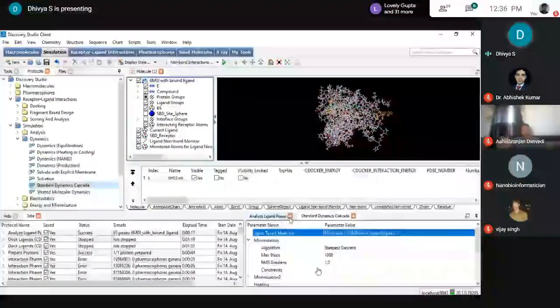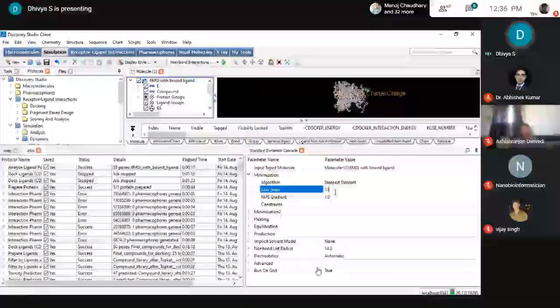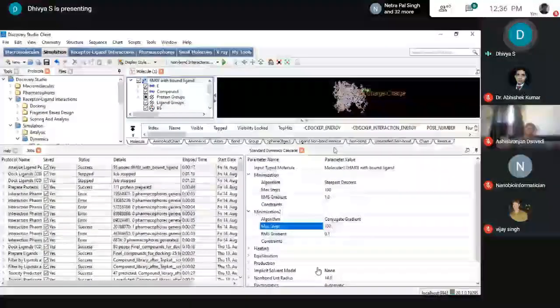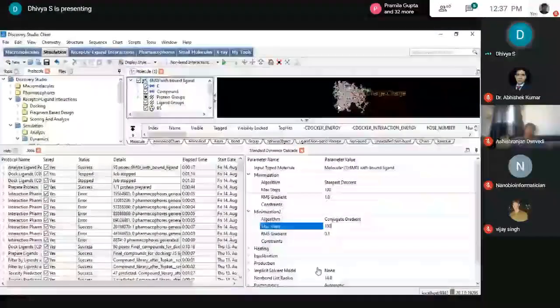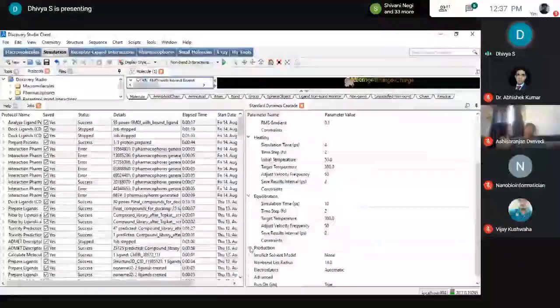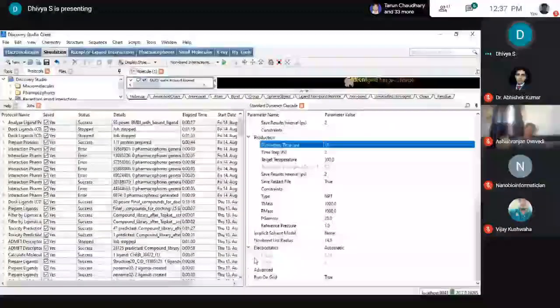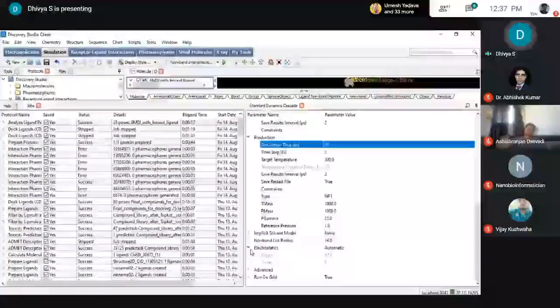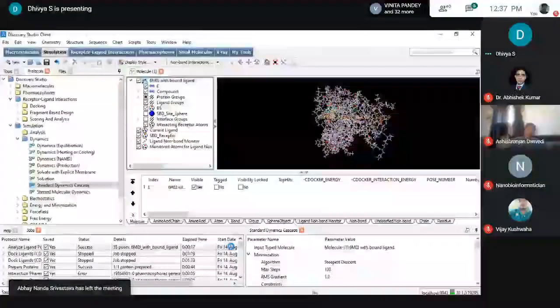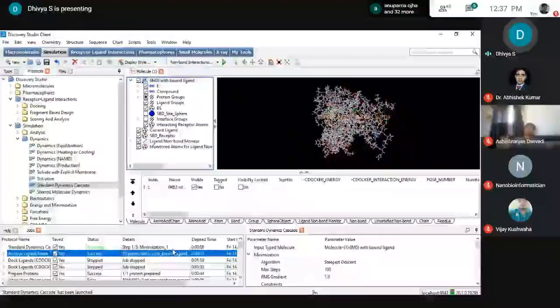Input your receptor and choose algorithms. For the production phase, you need to increase the steps — one nanosecond equals 1,000 picoseconds, and ten nanoseconds equals 10,000 picoseconds. Choose the canonical ensemble type and implement methods like Leapfrog integrator and Velocity Verlet. Keeping all settings as default, run the process. After running, you can see the standard dynamics cascade with steps: step one, step two, step three, up to five steps, then production. After production, analyze the trajectory under Simulation Analysis.